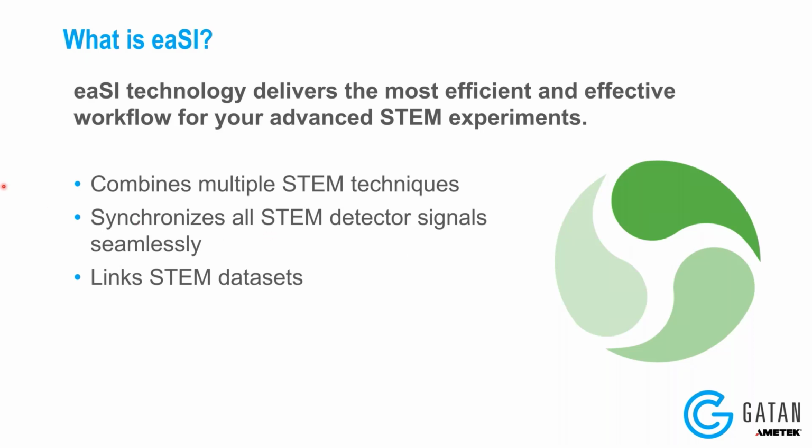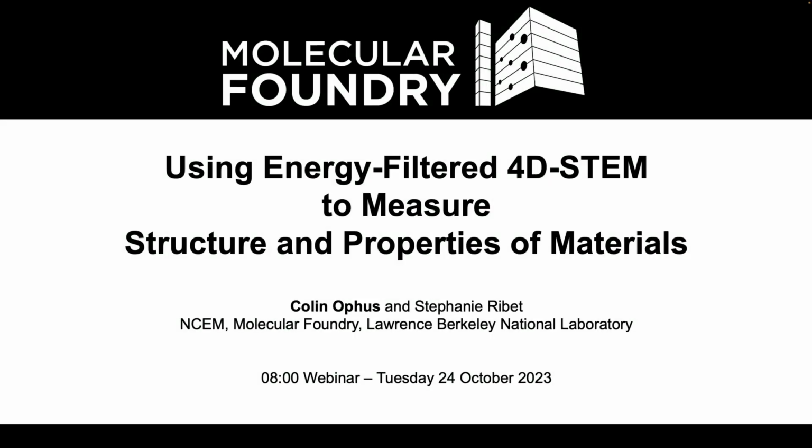Now I'm gonna give the floor to Colin, and he's going to tell us how EASY technology combined with the K3 and the GIF Continuum allows energy filtered 4D STEM data acquisitions. Please, Colin. All right, thank you so much, Anna, for the kind invitation to speak and the introduction.